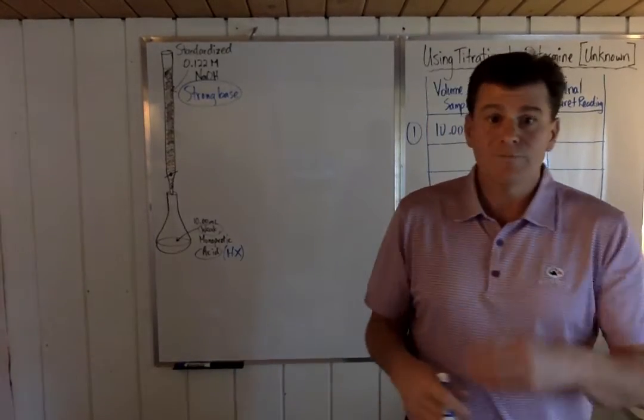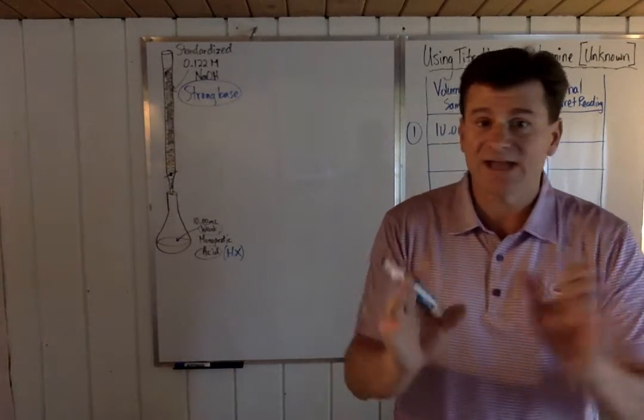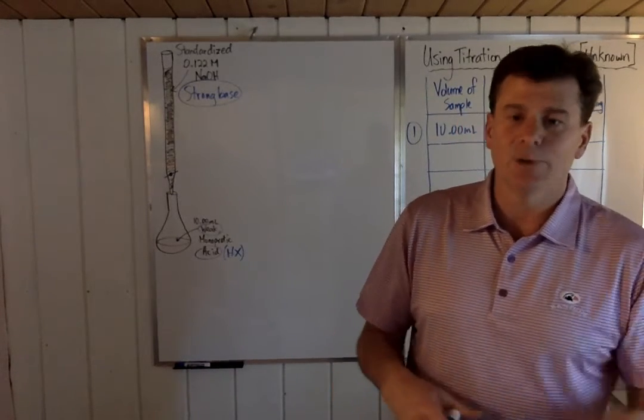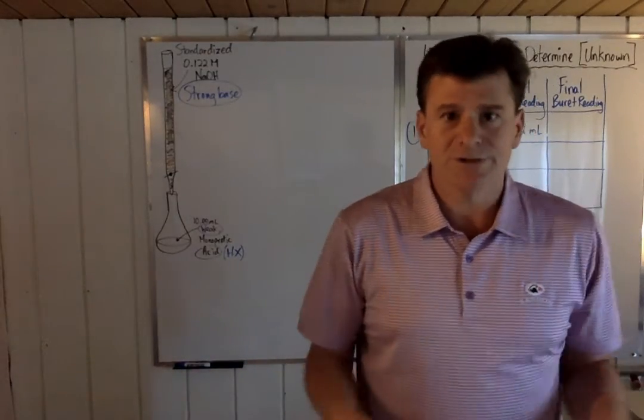Okay, over time, carbon dioxide will dissolve in there and react with the sodium hydroxide. So after 2 seconds, you can't really say, well, you know, a minute later, the pink disappeared. Oh, I wasn't done yet. Yes, you were. Okay, it's the carbon dioxide. So you go and you go and you go until that point.